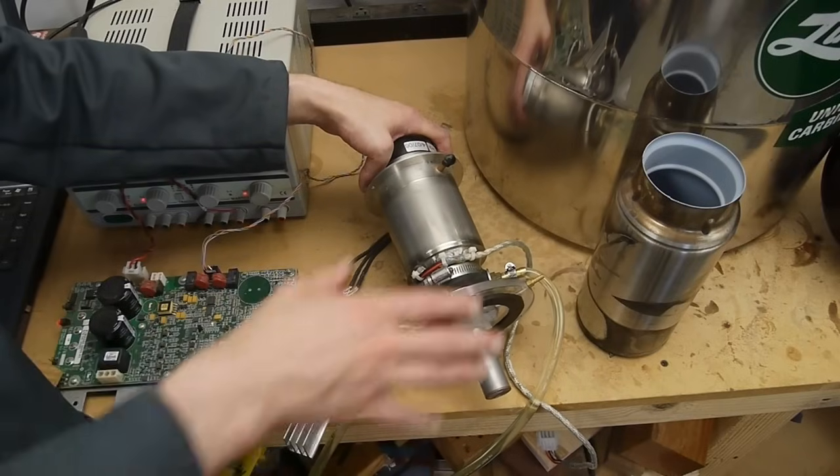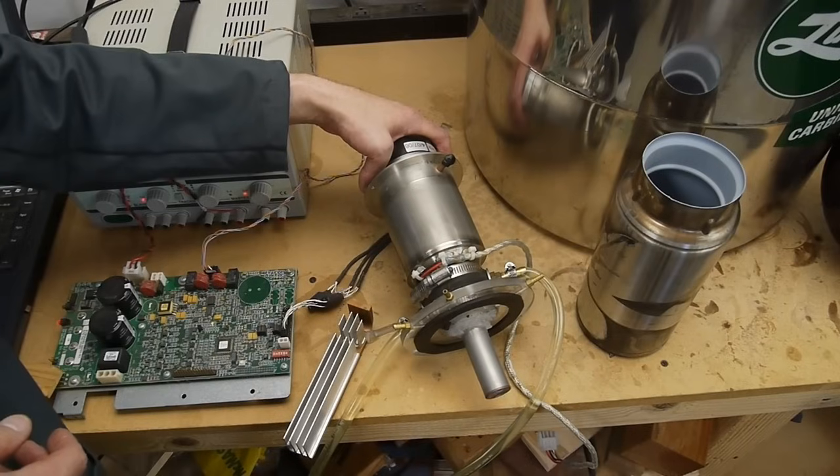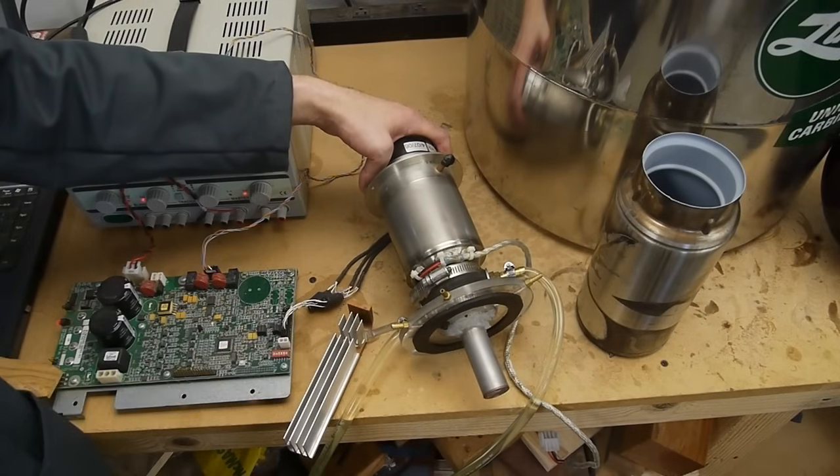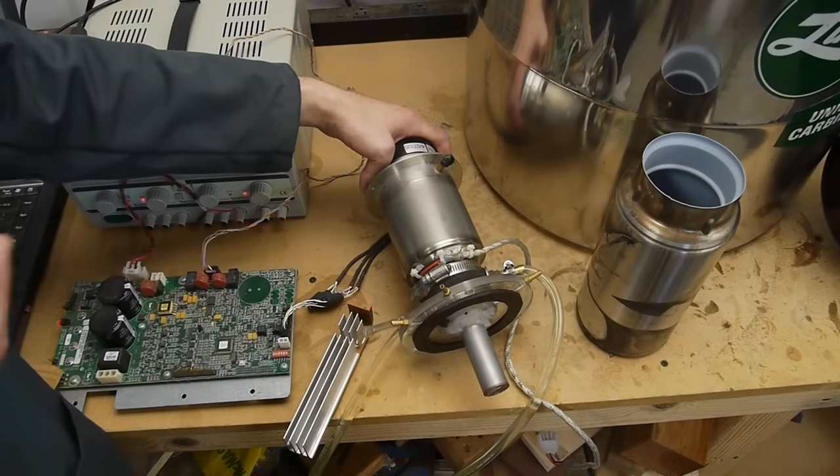What will happen is the tip will get really cold and the thermos will keep the air from forming too much ice on here and eventually the entire system will get cold enough to start liquefying nitrogen out of the air. Since I'm not going to use the nitrogen filter we're also going to be liquefying oxygen out of the air so the result we'll have is liquid air basically.